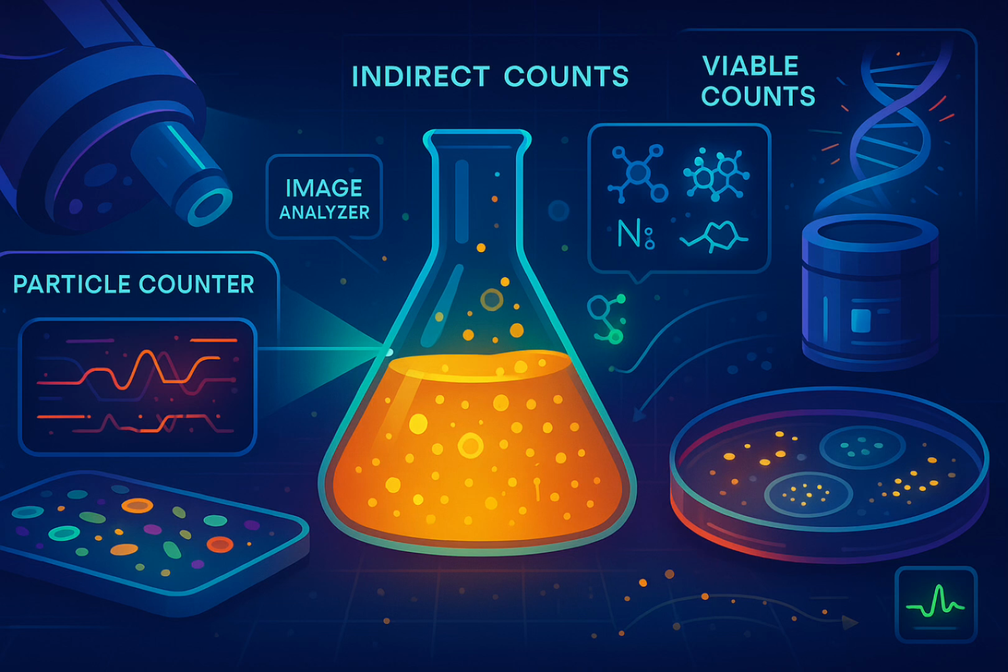Then incubate. And each viable cell that can grow on that medium under those conditions forms a visible colony forming unit, a CFU. Little clump of cells. Yeah. You count the CFUs, factor in the dilution and volume plated, calculate back to the original concentration. Seems simple. Count the dots, do the math. But the catches, I know there are big ones.